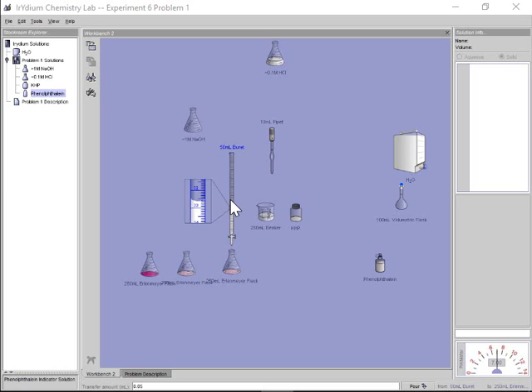So fortunately for me, I still have my virtual lab open, and I still have some NaOH. It's still fresh. It's uncontaminated here. I'm just going to pour this back into a beaker of some sort. I want to do this dilution, and maybe I want to dilute by a factor of 10, so my 0.92 molar would drop to 0.09. In case this one here was also like 0.09 or so, maybe I want to dilute a little bit more than 1 in 10.